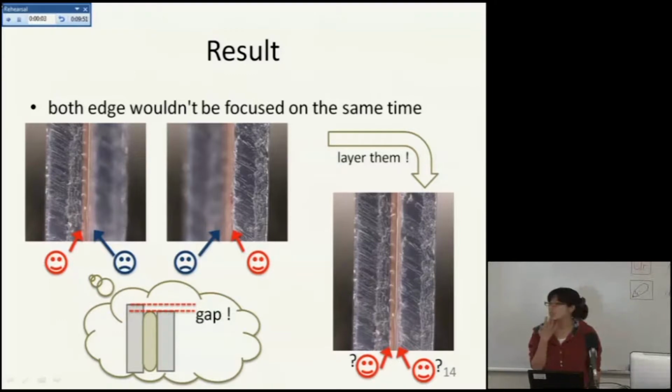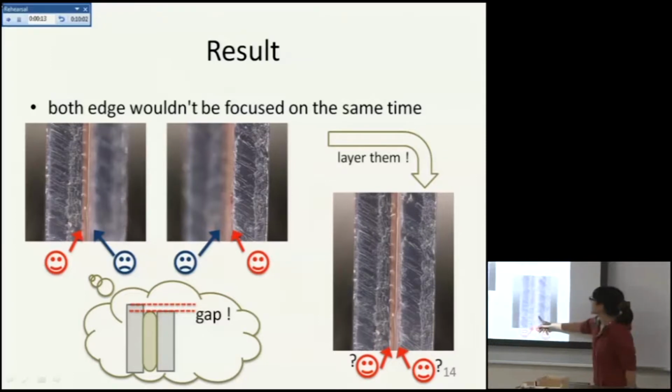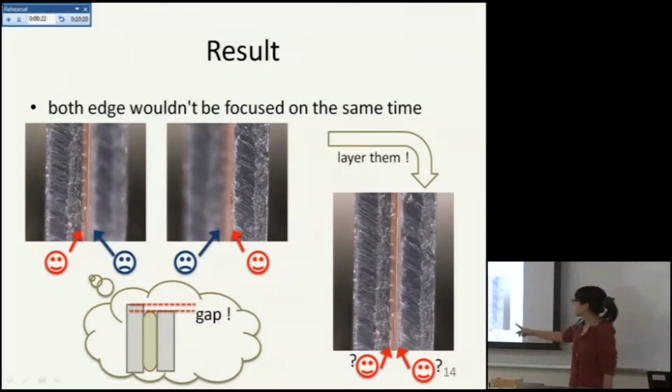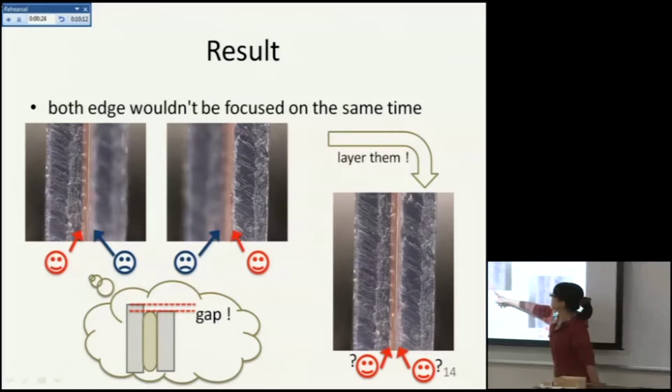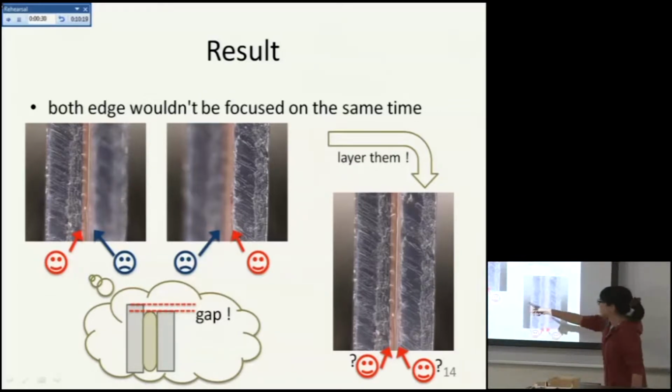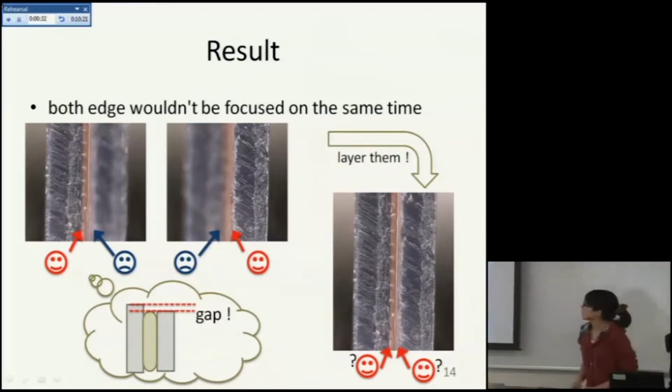And these are the resulting images I got from the microscope. So this blue one, purple one is the cover glasses, and the center one is a sample which is stained with red. And as I said, I want to measure the aperture of these glasses, but these are still images obtained from the microscope.